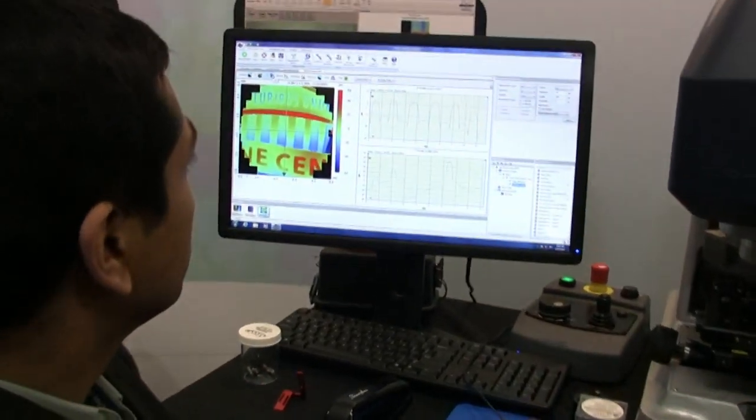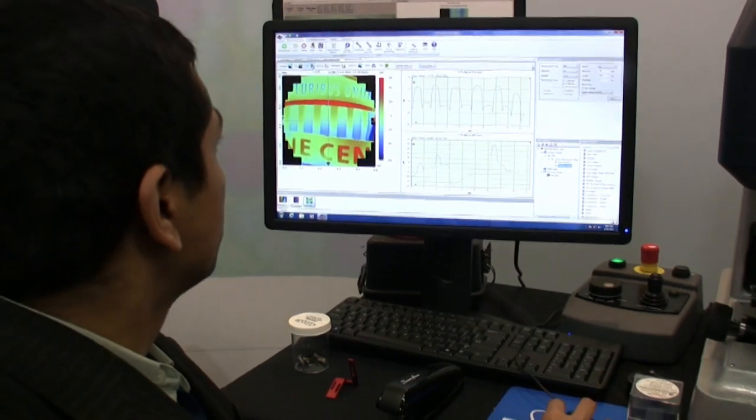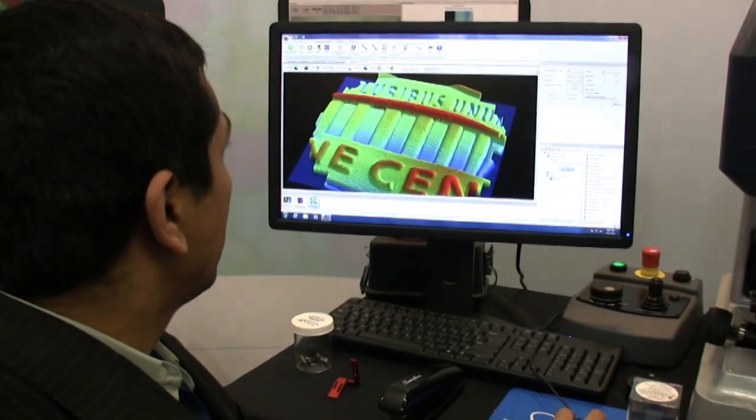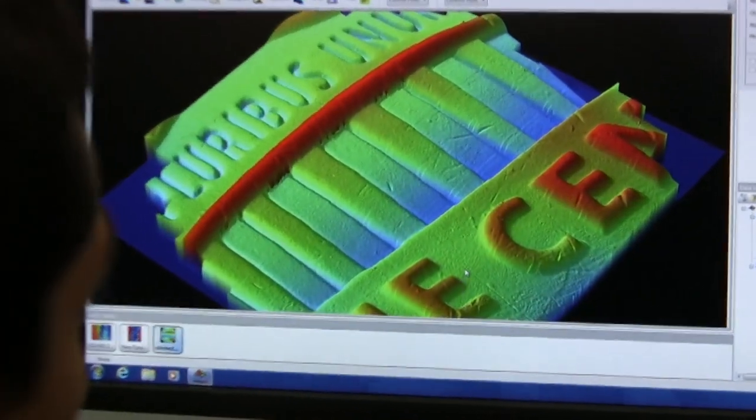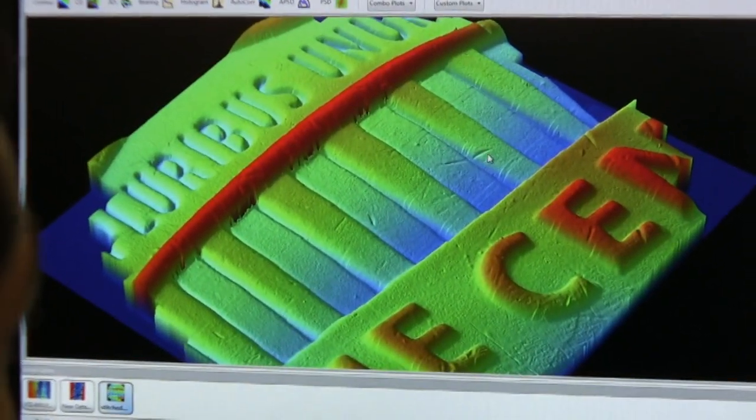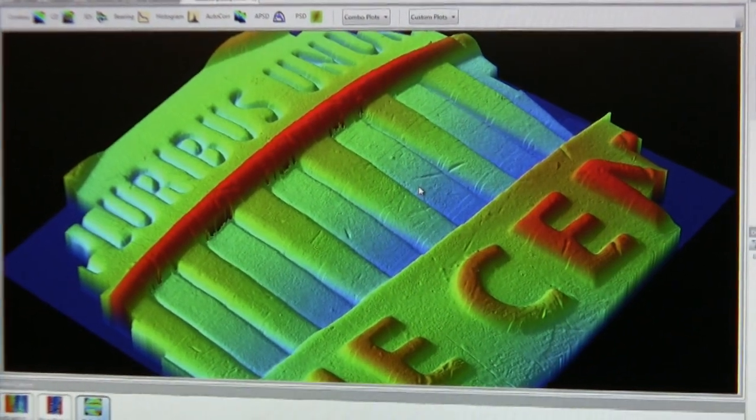Here's a small section of the penny. This was a stitched measurement - we took several measurements on the surface and you can look at how the penny looks in three dimensions. You can analyze scratches on the penny, defects in the copper surface - very high resolution measurement.